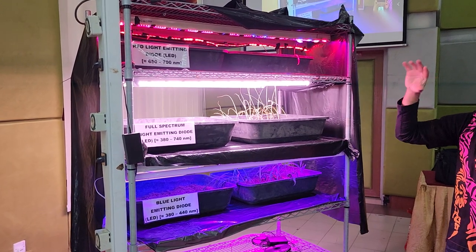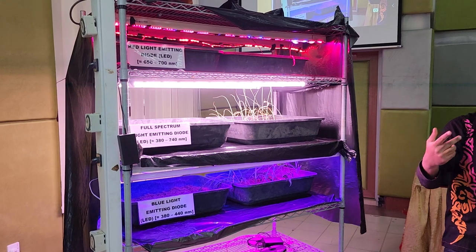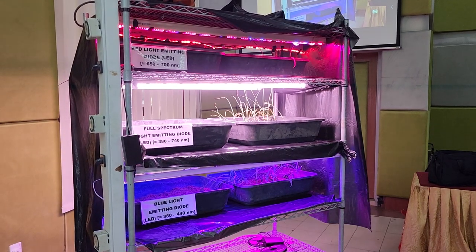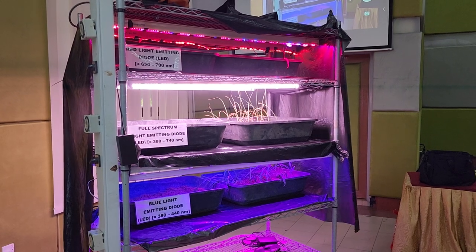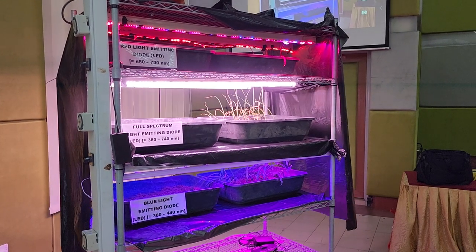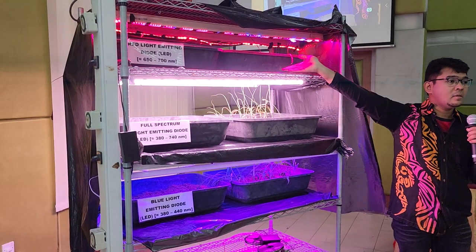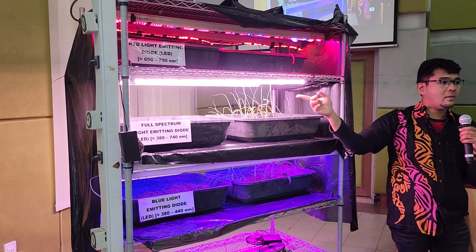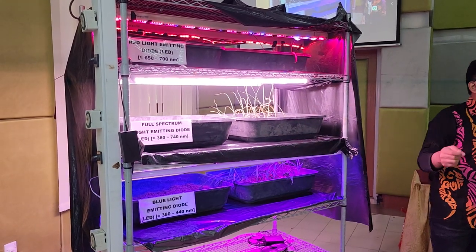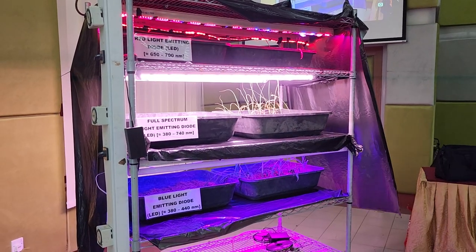These three are actually utilizing different kinds of light quality. If I were you, with machine two, you can play around with this here. You can use the machine to play around if you want to look at what the spectrum is, where the intensity is highest. This is what color? Maybe you can have a hunch. What's the dominant color in here? So you can use the machine.